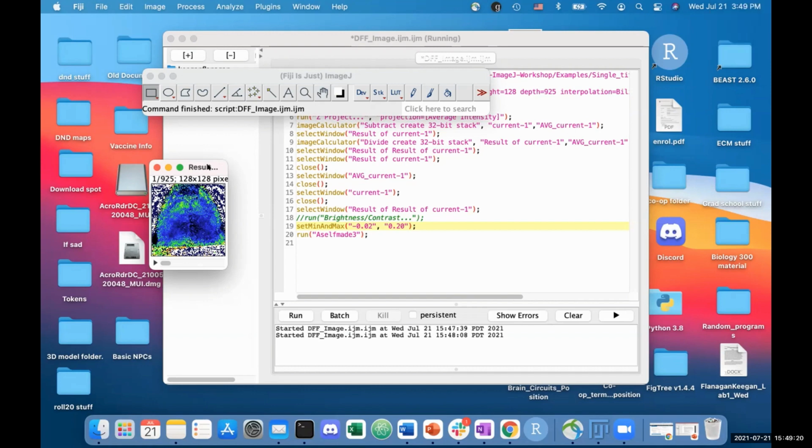I mean, I can go in and go to Macros and then choose Edit, right? And then open my macro, and then I get some kind of code, like Python type code. So obviously I type stuff in there, but that's complicated compared to what we were doing with the Create function, where you just pick stuff and it kind of writes the code for you.